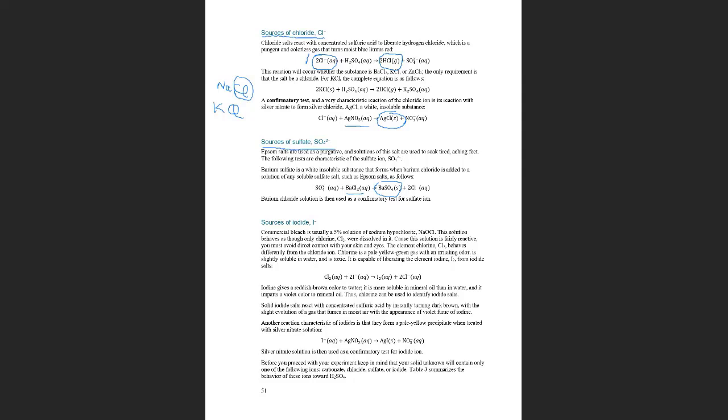And then what else are we testing? So many things. We are testing iodine, iodide. There are many reactions for iodine. The first reaction that is described here is the reaction with bleach. Bleach, when we buy it, is usually a solution that has 5% hypochlorite.